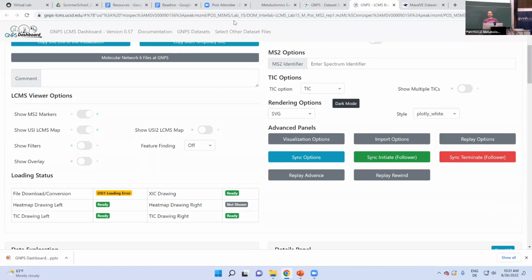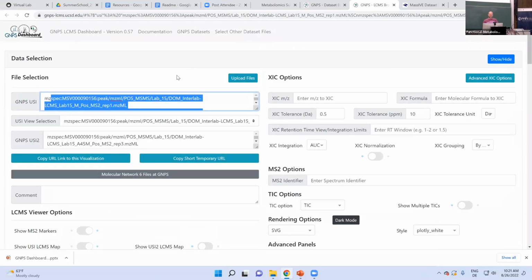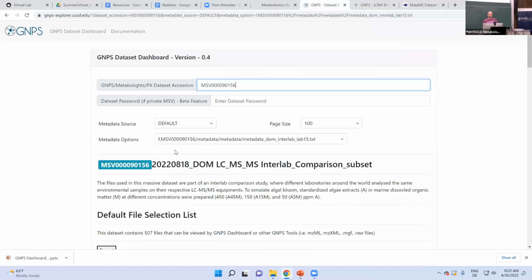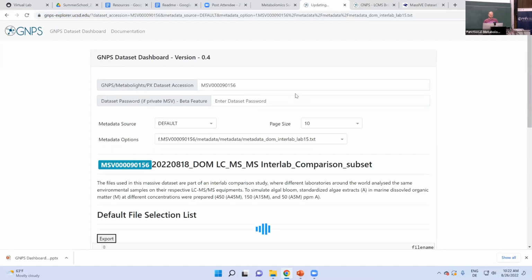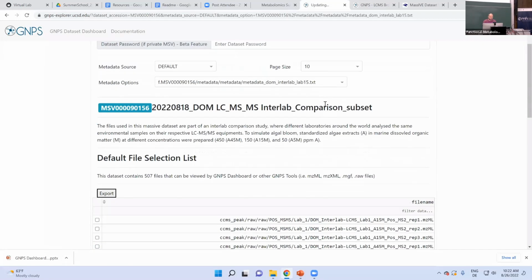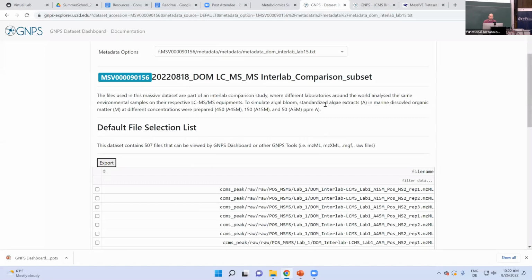Well, I hope we didn't kill the server at UC Riverside now. No, no. So you don't need any login. The job, so we can open it to the discussion. I didn't cancel.